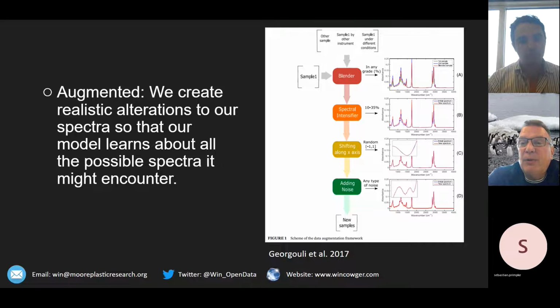But I think that's very much needed, though it's not come as far as you have come with the FTIR and the Raman spectra. Yeah, but definitely an up-and-coming technique that I think we'll see getting used a lot more, especially once we figure out how to automate the analysis routines a little bit better.